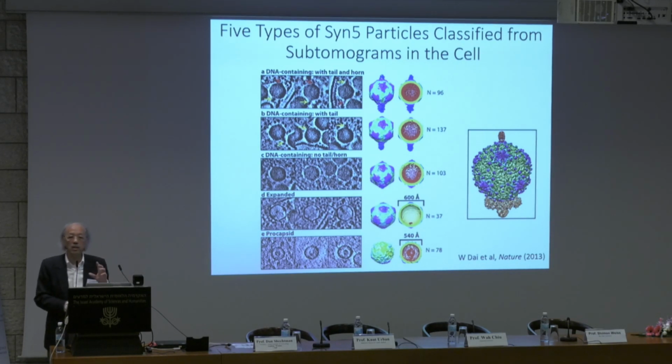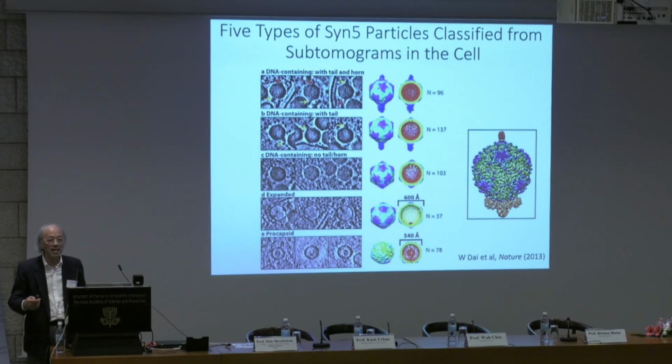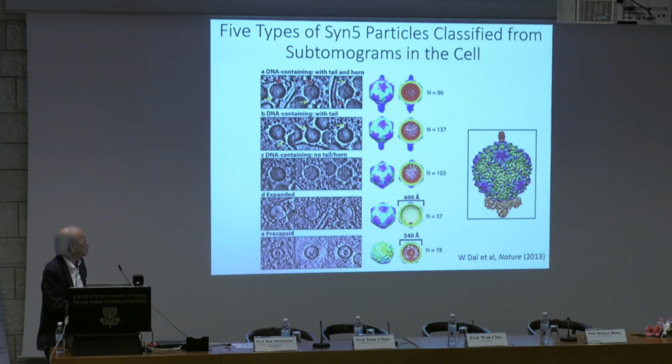But a lot of these molecular machines or intermediates in the biological process are just so labile or so short-lived that you cannot even biochemically purify them. So this is a step using cryo-electron tomography: just looking at the tomogram, doing the data analysis, we can capture different types of intermediates during a biological process. In this case, it is the virus assembly inside the cell.